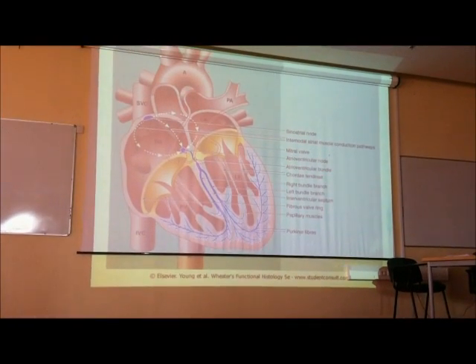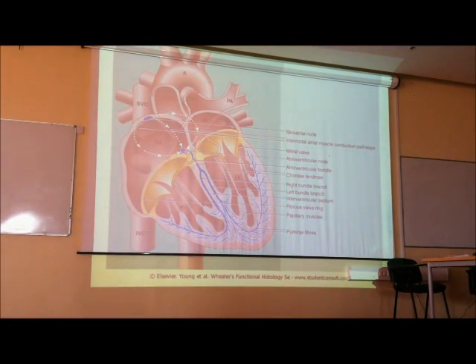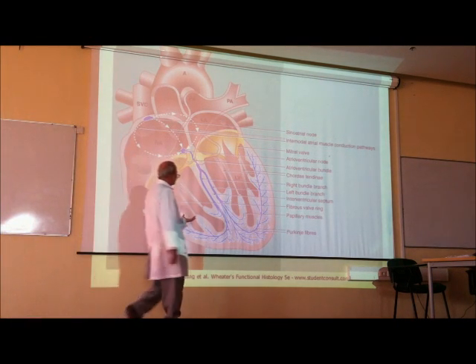This is the slide of the heart that I want you to see, but not for the exam. Do you see papillary muscles? Here are the papillary muscles in the floor of the ventricle.